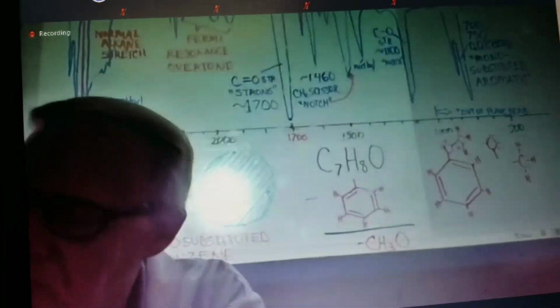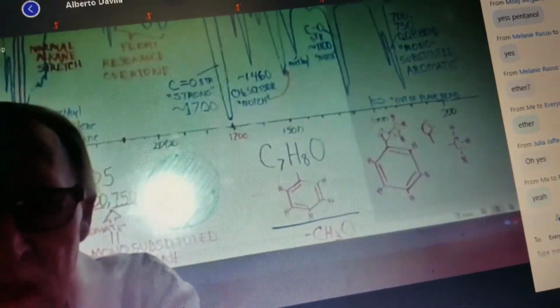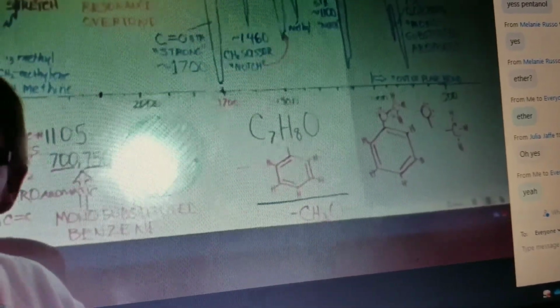So it's anisole. Remember? We just did one on aromatics, right? We just did an exam on aromatics. It's anisole. That's what anisole would look like.